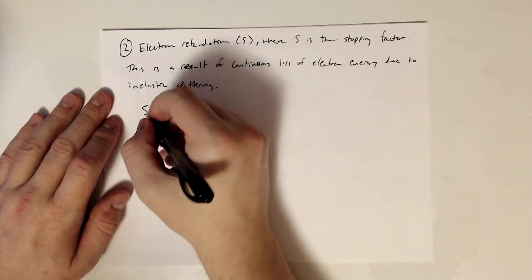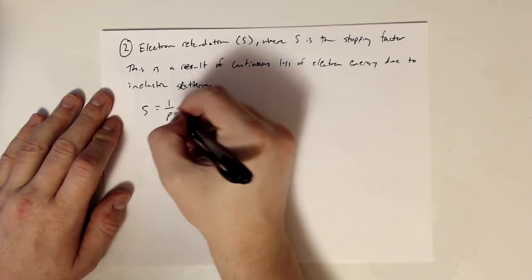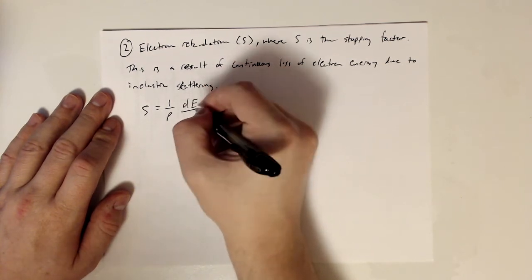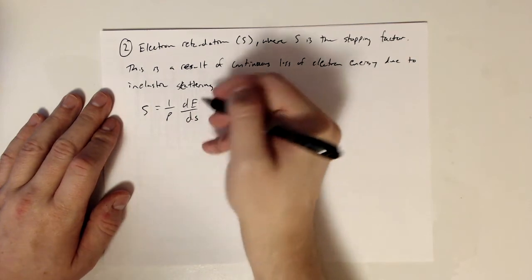So S is 1 over rho, the density, times the change in energy with distance.